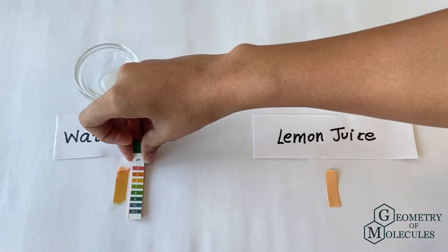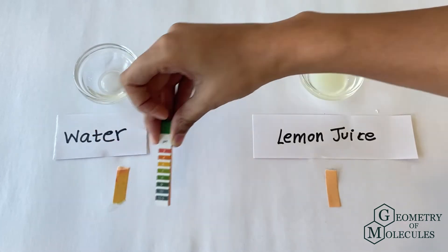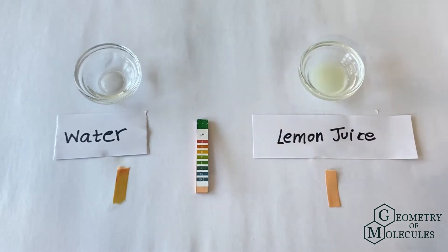As you can see, the strip has instantly changed its color from orange to light green. That means that the pH of water is 7, which is neutral.